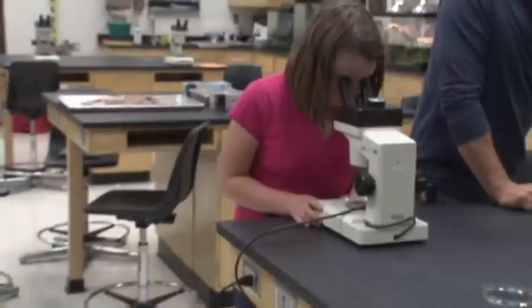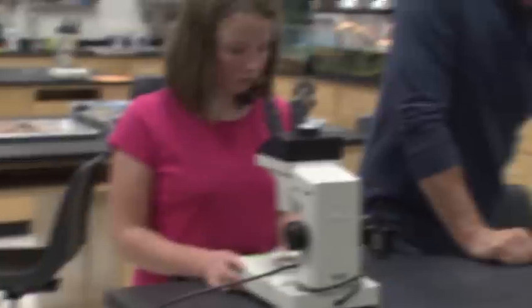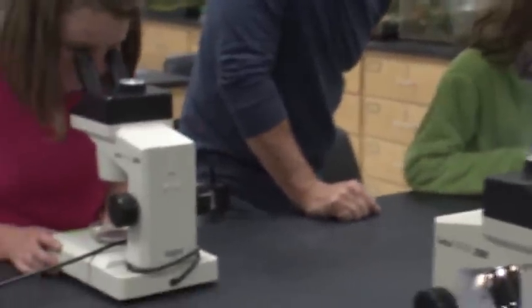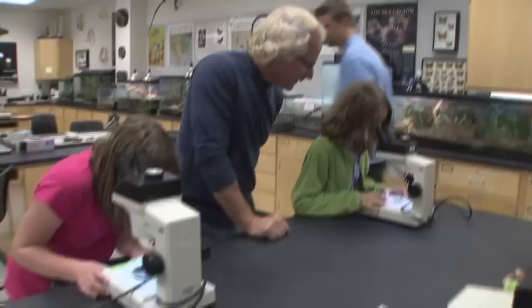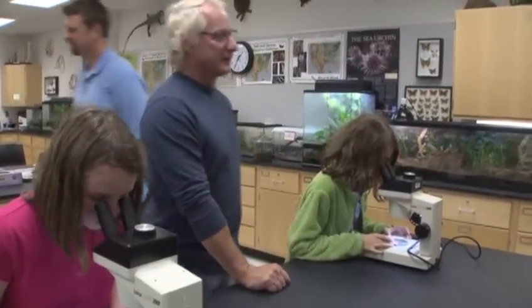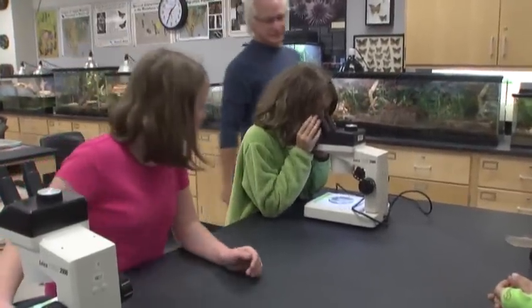Isn't that cool? There's like a little mouth on there. Look at that, they're pretty cute, aren't they? There's a little mouth on there. You can adjust that down. Yeah, that one's a good one. Brad's got quite the setup, actually. Oh, I know what that is. Play with the lights too.